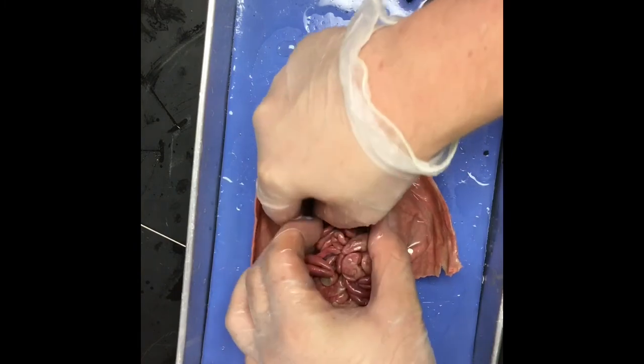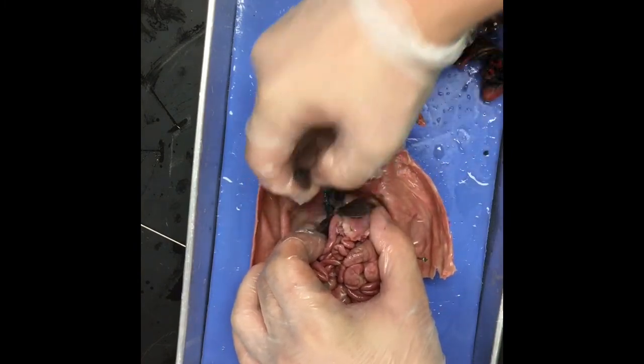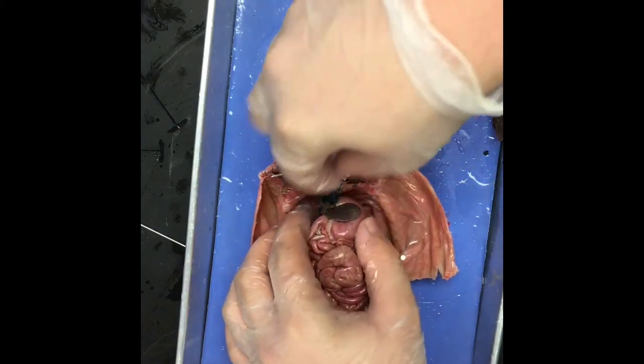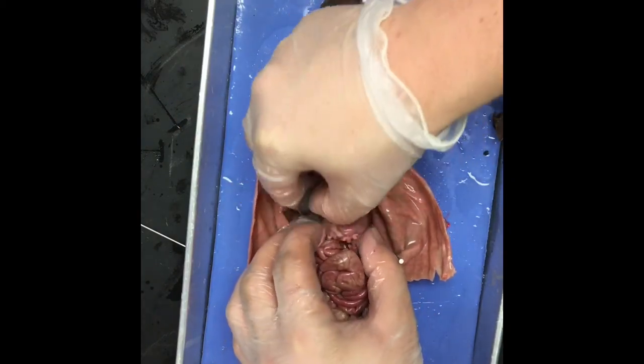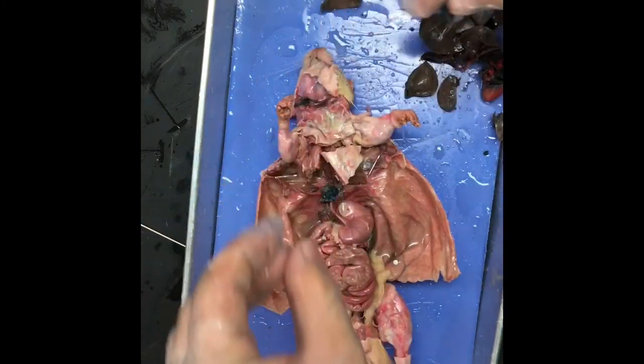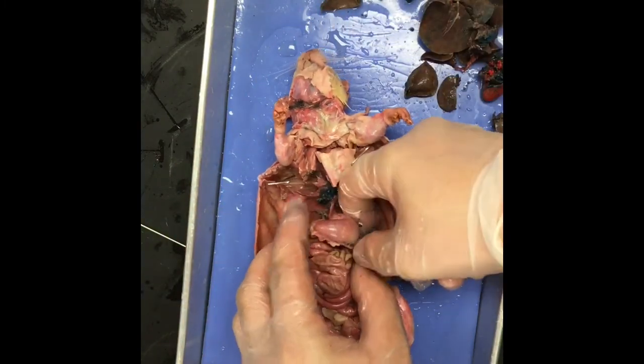Very carefully. Just ripped it out. I wanted to break it down, but I don't know. Probably intestines. You're feeling it. Is it mushy, the liver? Is it solid? All right. So don't forget the pancreas.